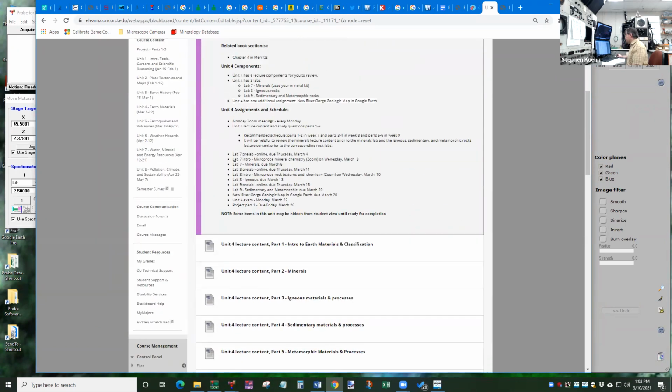All right, so this gets us beginning on lab 8. So of course we have the pre-lab tomorrow, and then as it says, intro to using the microprobe to help us out with rocks today, and of course the main lab on Friday. And again, we'll be meeting in person for lab this week.